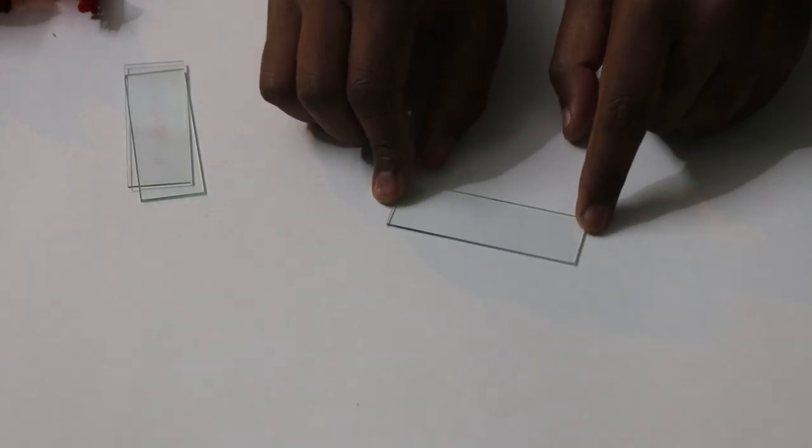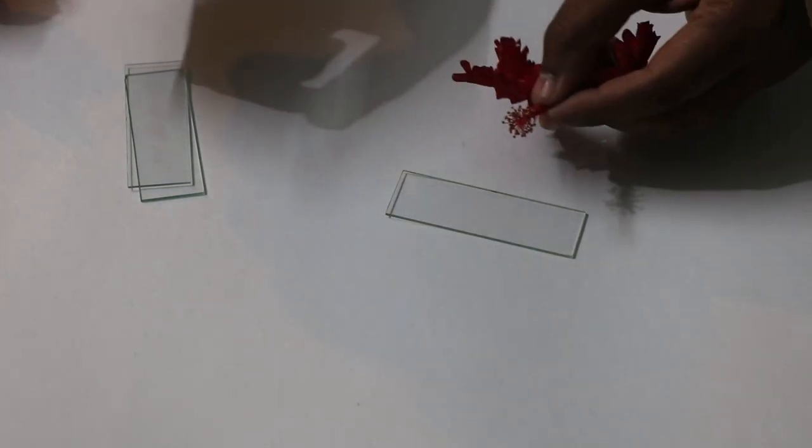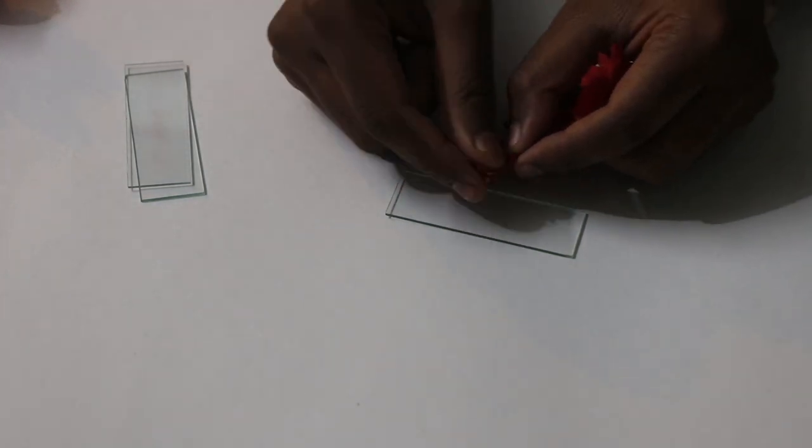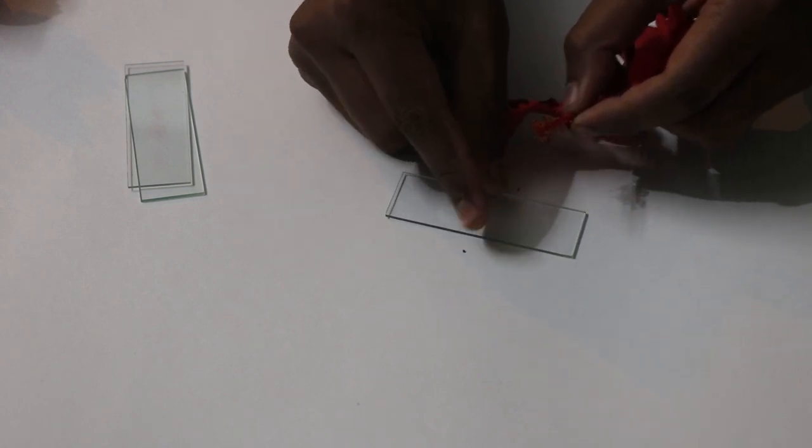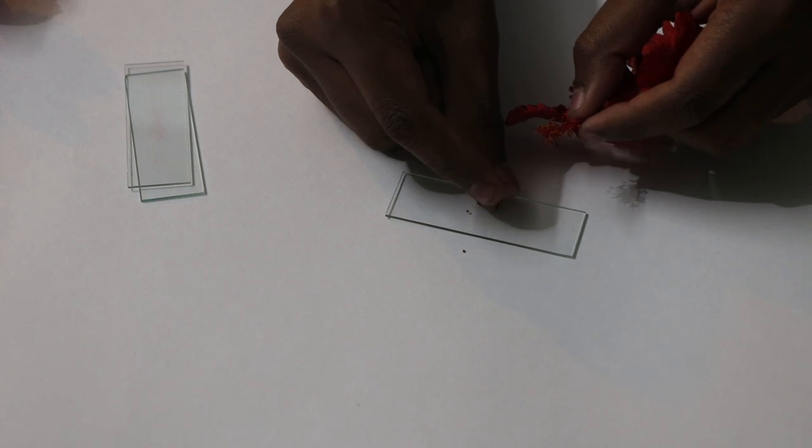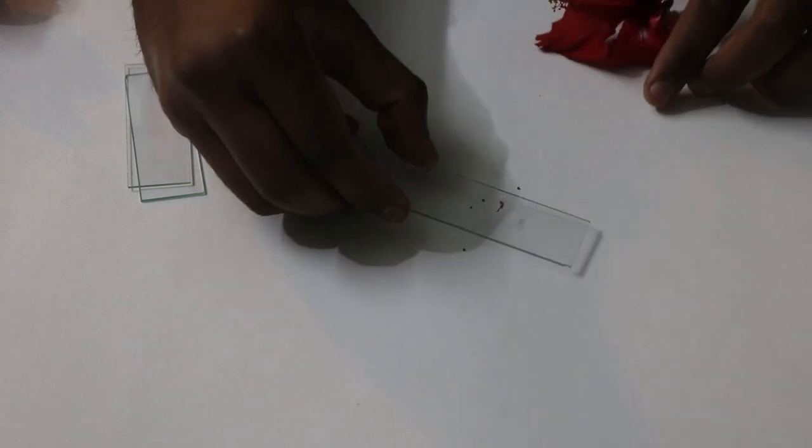Now take the glass slide and sprinkle some pollen grain on it. Here you can see I have also added some anther with pollen grain.